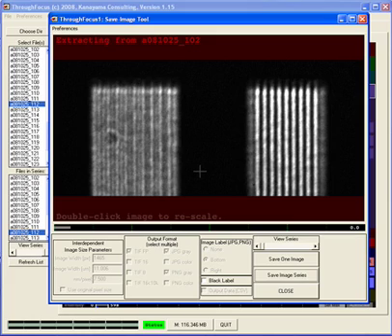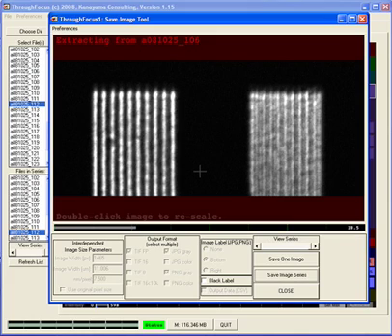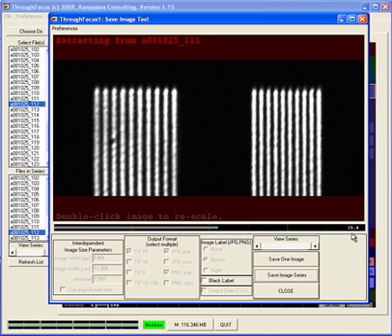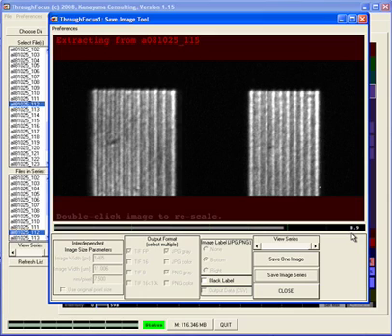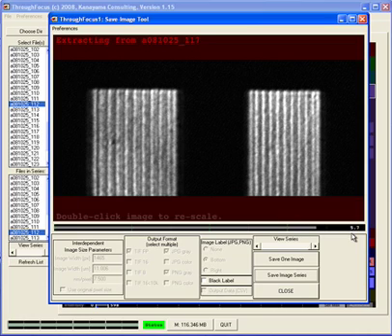So it's going to go through, it's calculating the background properly. Notice how it's going through focus. It's giving us an estimate that there's about 20 seconds left here. It's calculating. Each time it's going, it's generating the output files. We'll just let it go. Almost done. A few more seconds here.